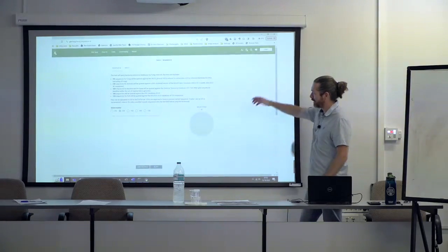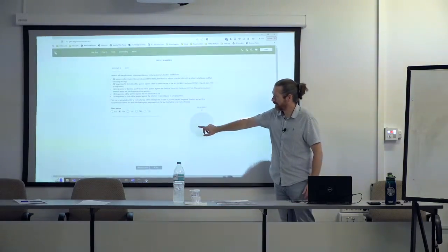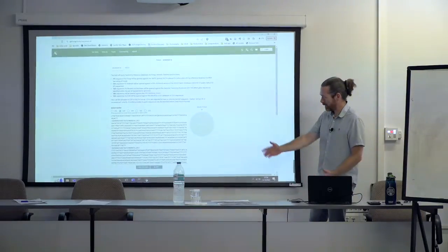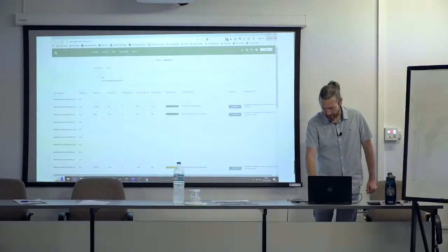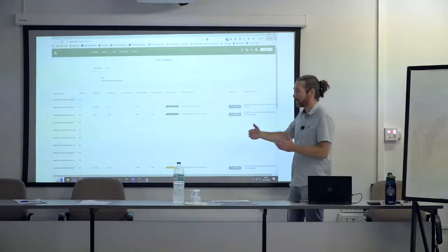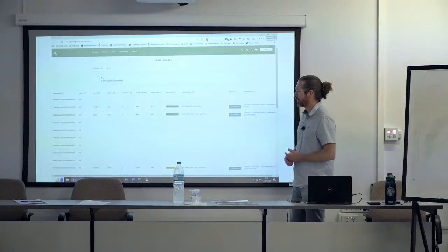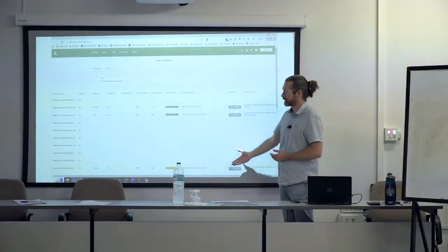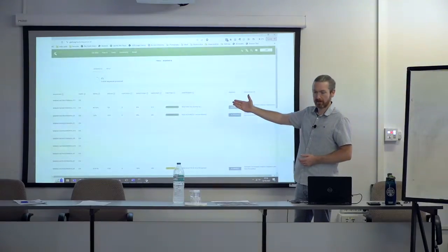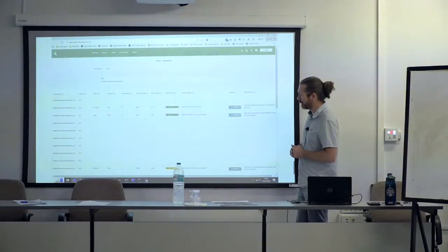Here is the web page. You can either stick your FASTA file over there, or you can paste your sequences over there. Voila, look at that, one I prepared earlier. And this is what happens when you do that. It magically goes off and does a blast search against that clustered public database. I had hoped we could have filled the screen, but it stopped at 3 out of 84 sequences when I tried this the other day. So for demonstration purposes, good enough.